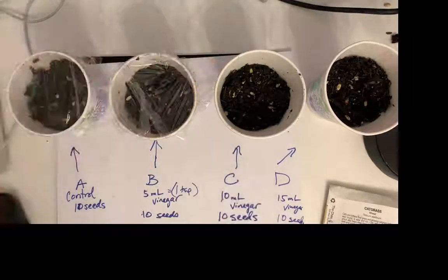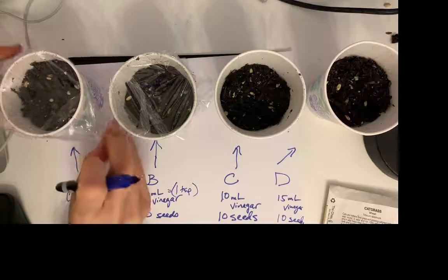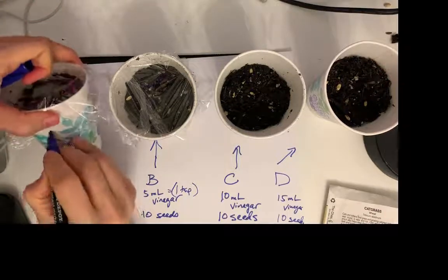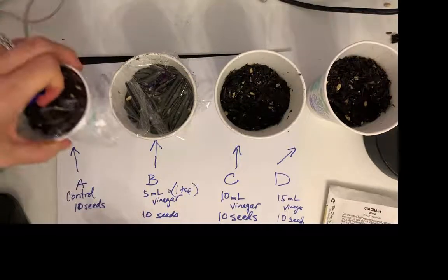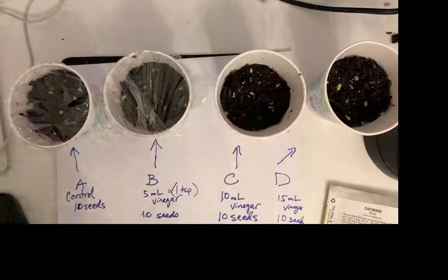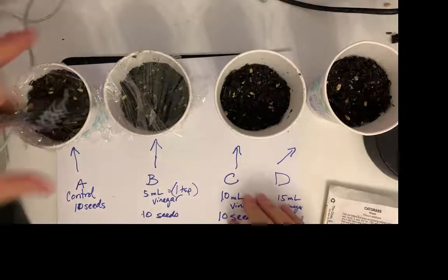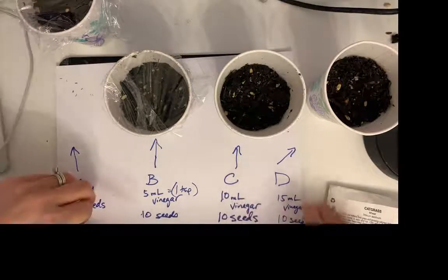Okay, I'm noticing I didn't even label my cups, but I will definitely label my cups, and I will put these in a warm place and see. Once they start germinating, I'll start recording my data, but I might go ahead and still start recording data.